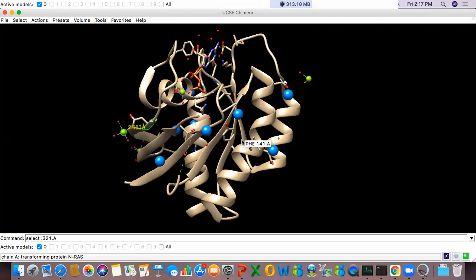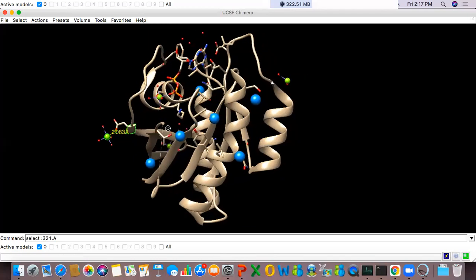So 4.5 is a kind of ballpark figure, which comes from all kinds of atoms that you're looking at, and then you use one single cutoff rather than trying to do it for every single atom. So if you're doing carbon, oxygen, then to look at the van der Waals radii, instead of doing that, you use one single cutoff, 4.5 angstrom. Okay, so that's how you know whether any two atoms are interacting or not.